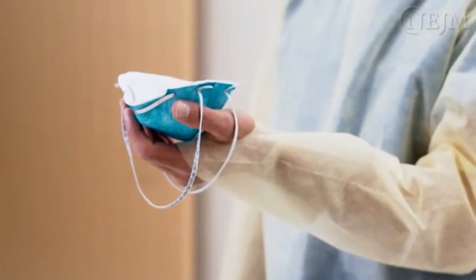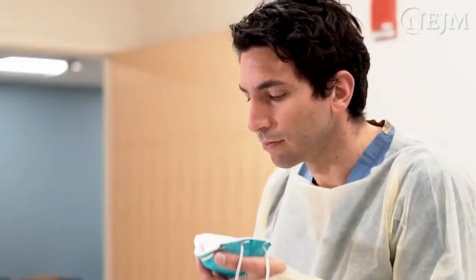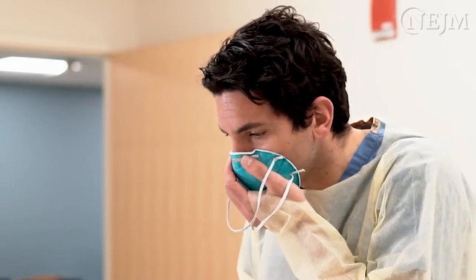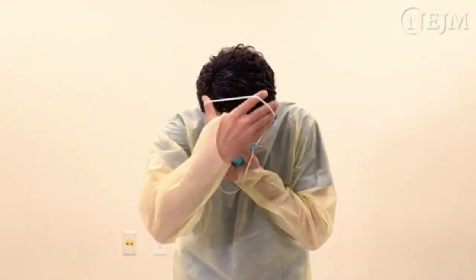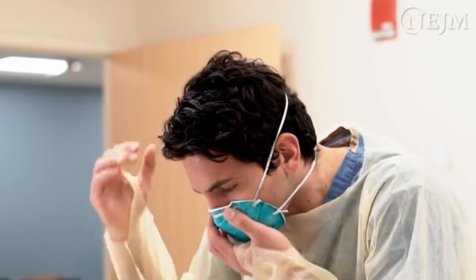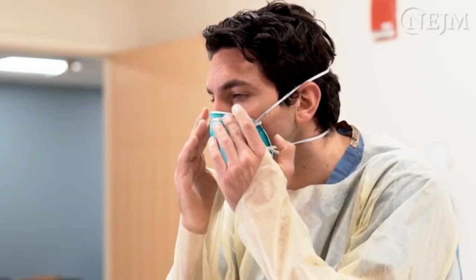When using a respirator, cup the outside of the respirator in your dominant hand, holding the pliable nasal strip with your fingertips and letting the two straps hang freely around your hand. Bring the respirator to your face. Secure the lower strap around the back of your neck, and then secure the upper strap behind your head. Mold the pliable nasal strip around the bridge of your nose with both hands without tenting it. Do not pinch the nose piece with one hand.